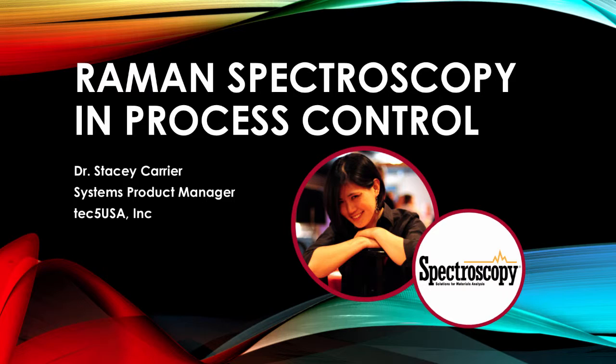There are several issues that I can see of why Raman spectroscopy hasn't gained a lot of notice within the world of industry. The first issue is that Raman spectroscopy requires a single wavelength light source, and usually these light sources, in order to have the amount of power necessary for Raman, are lasers, and lasers can be dangerous.